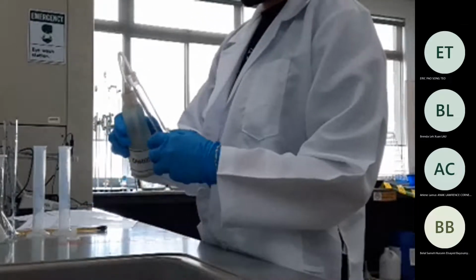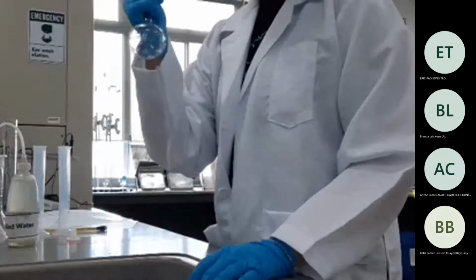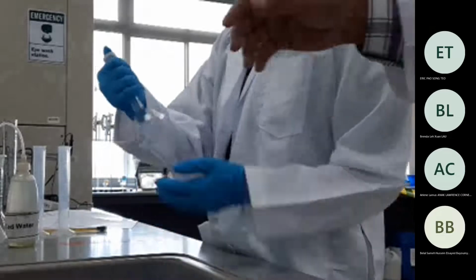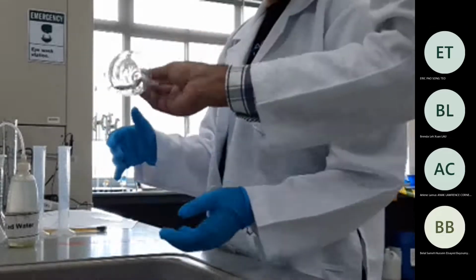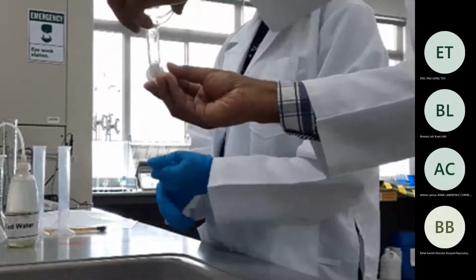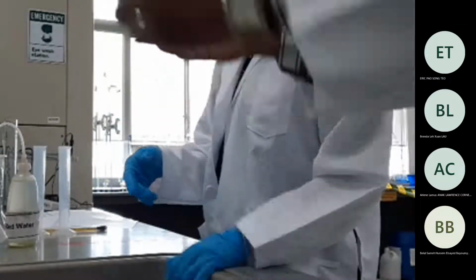Rinsing means not taking too much water, just a little bit, and making sure that it touches everywhere. No, not like that. You need to take the cap. And then do it like this so that it touches everywhere, a few times, and then throw it.